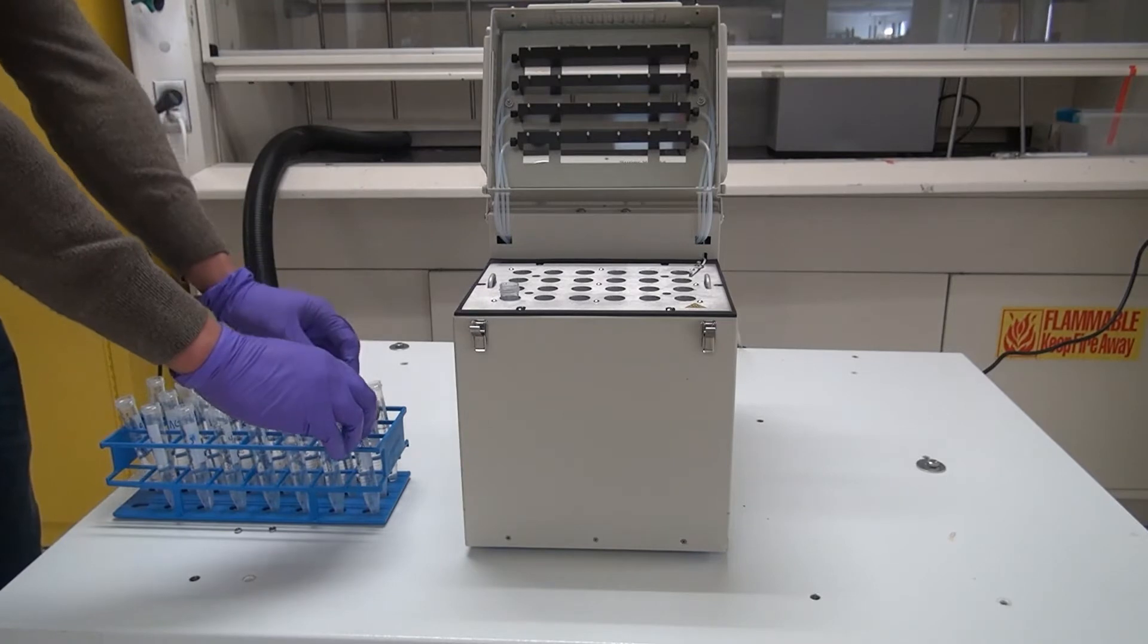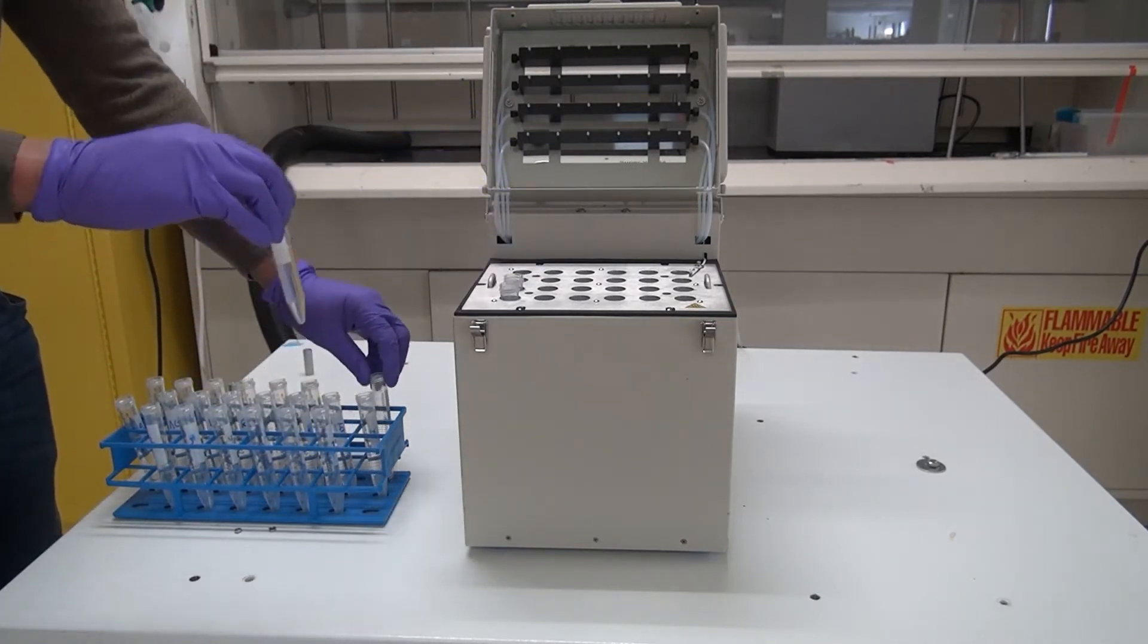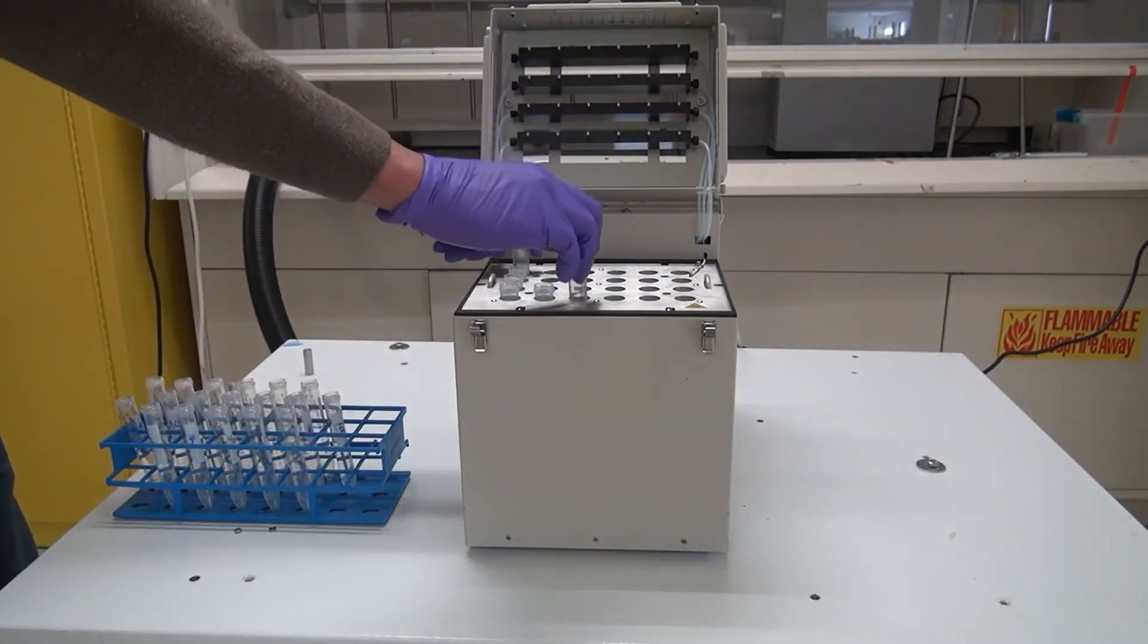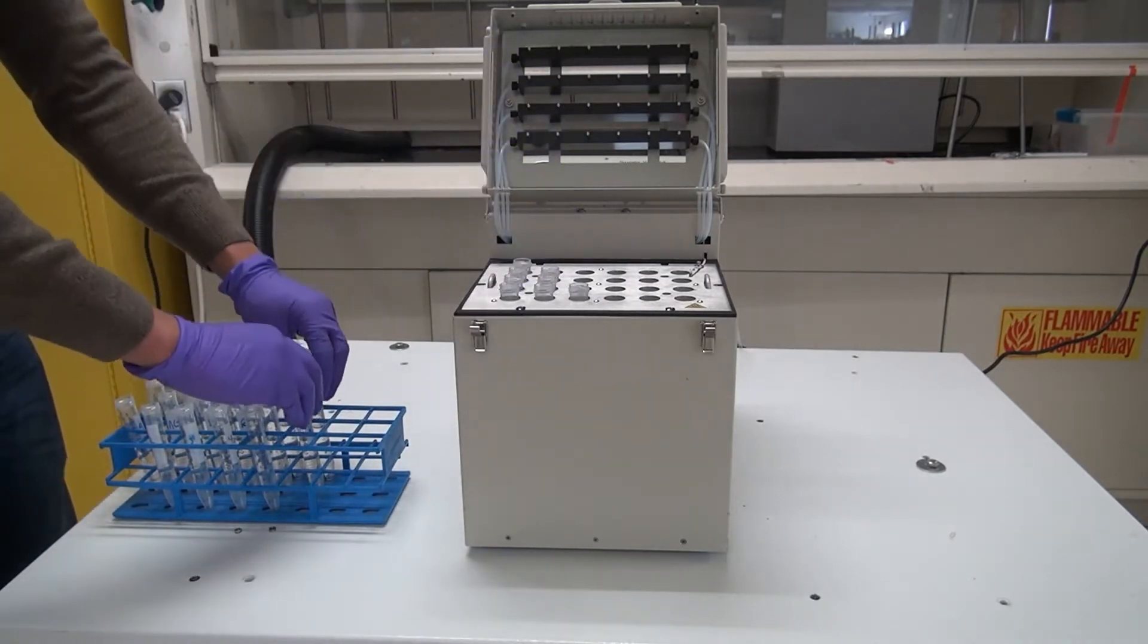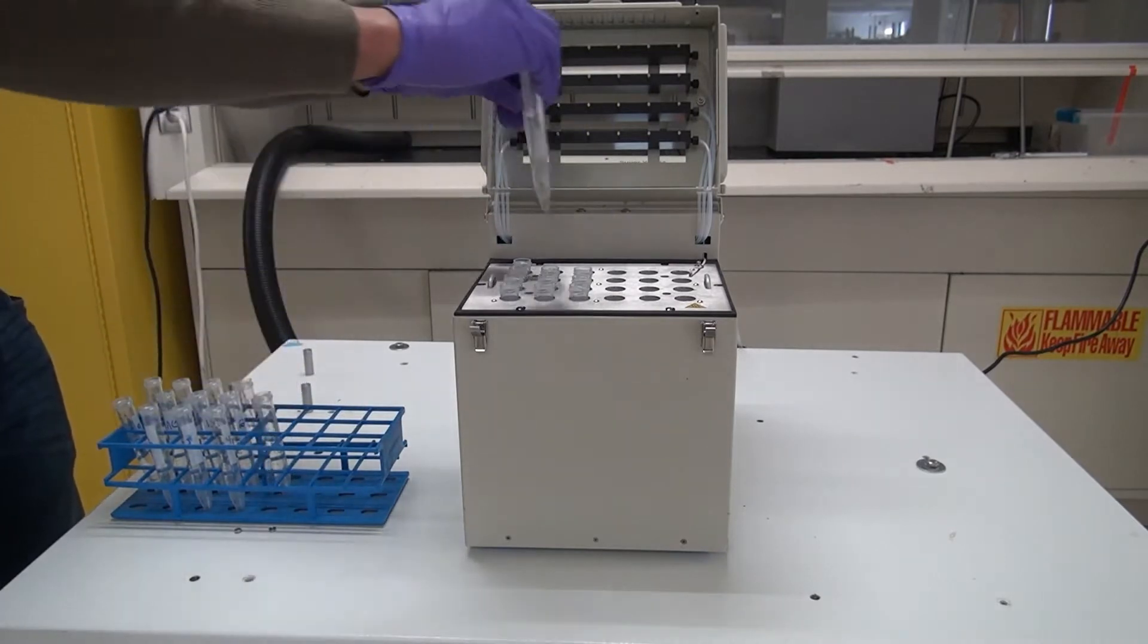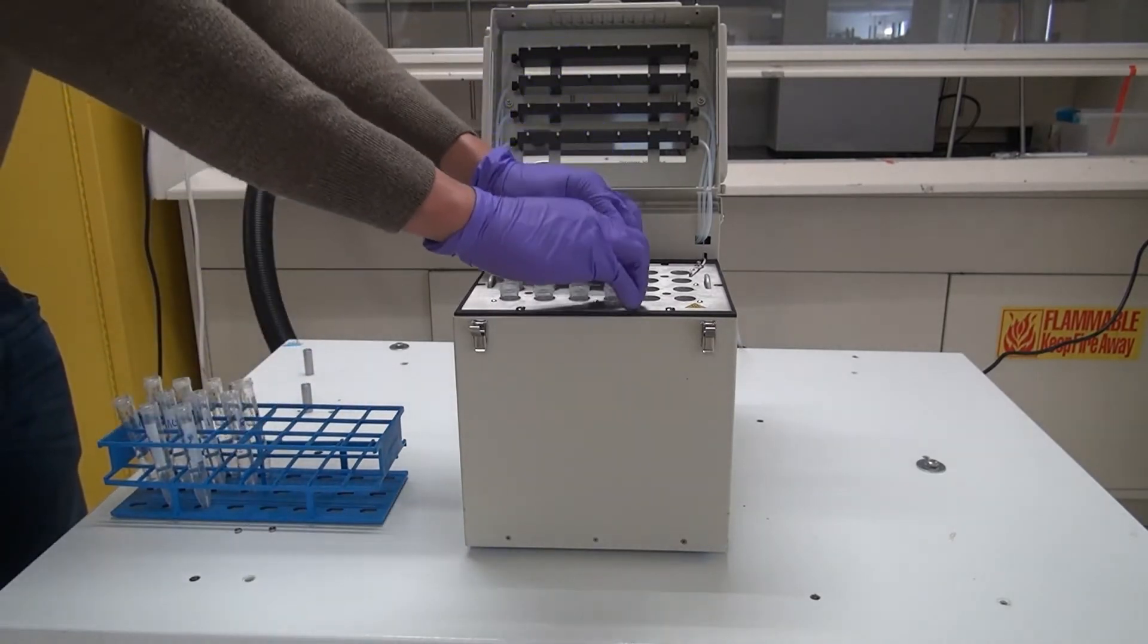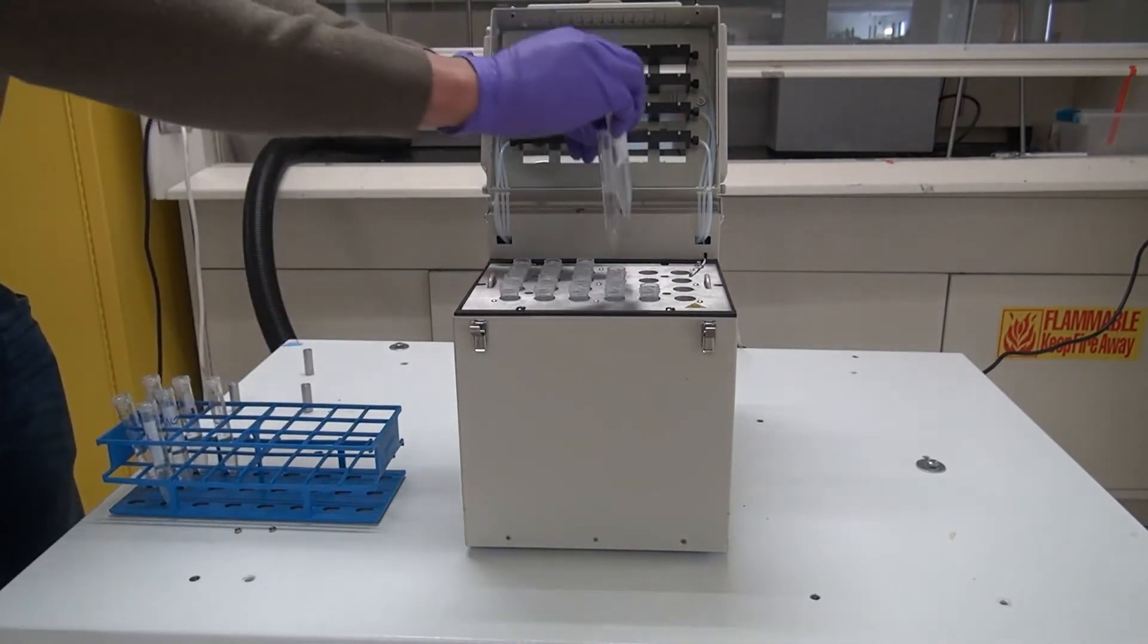This is a dry bath, so there's no water involved and we're using a sensor for just detecting time and heat. There is no endpoint sensor on this, you're just going to set a time to go to dryness or two mils, etc. and we will give you the settings to do that. Actually it's already pre-programmed.